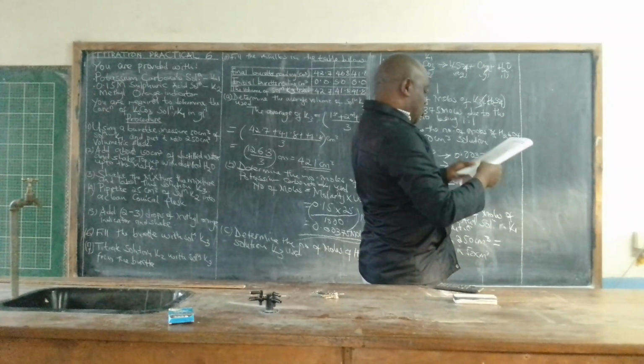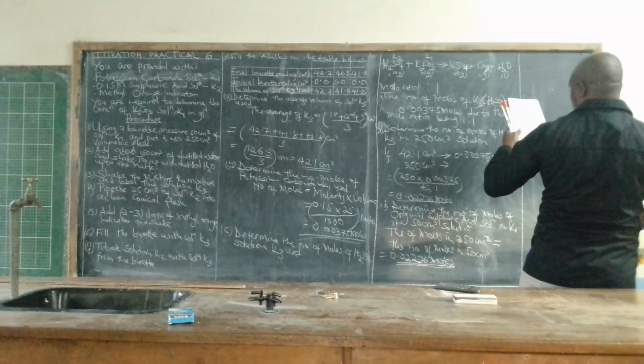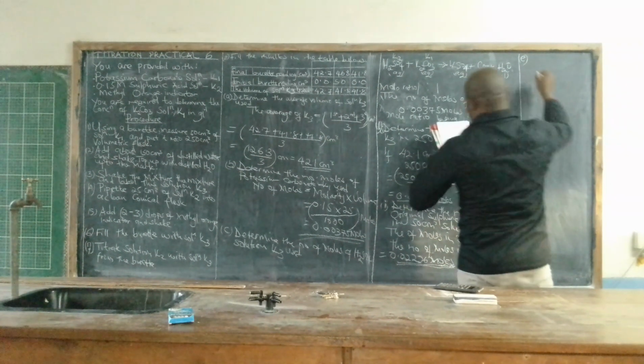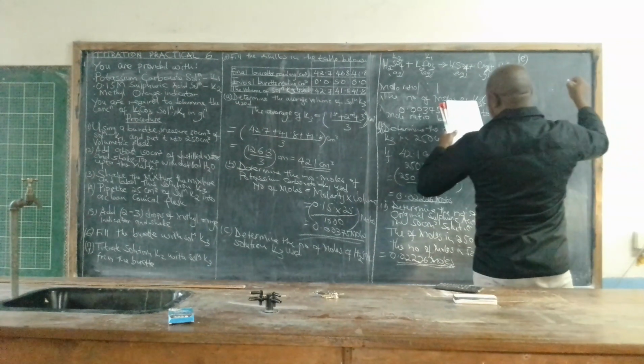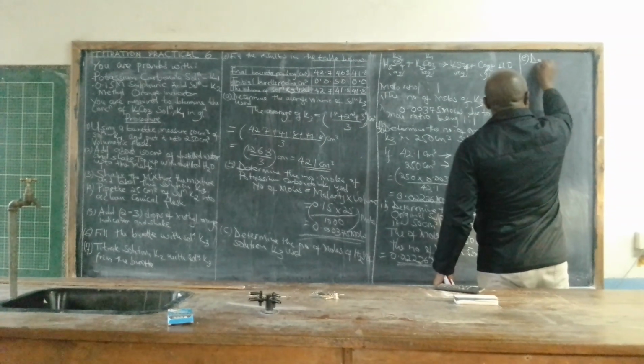So now we are going to E. We are going to answer question E. Determine the molarity of the sulfuric acid solution.